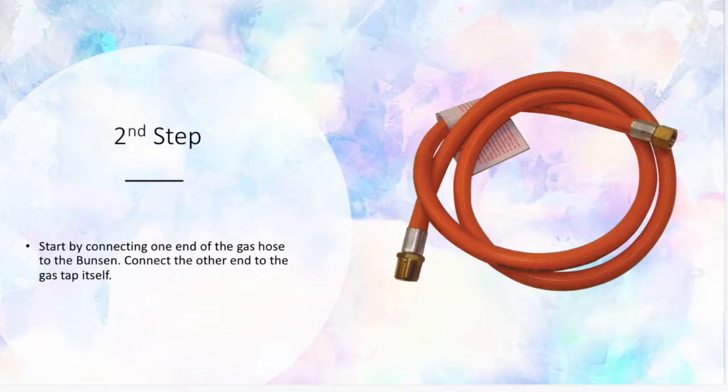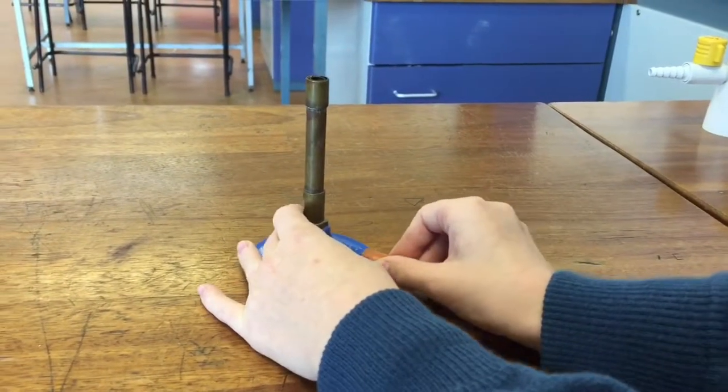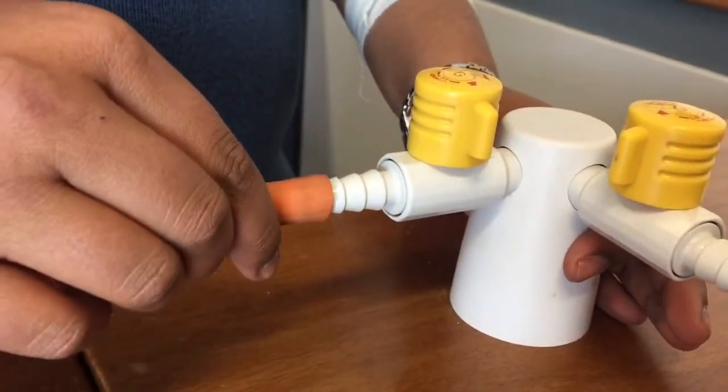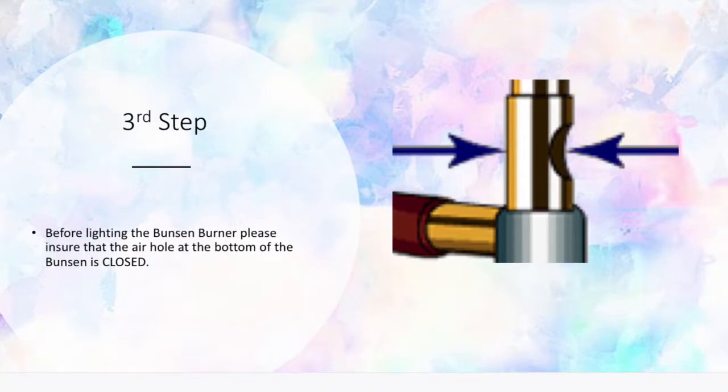Second step: start by connecting one end of the gas hose to the Bunsen burner, and connect the other end to the gas tap. Third step: before lighting the Bunsen burner, please ensure that the air hole at the bottom of the Bunsen is closed.